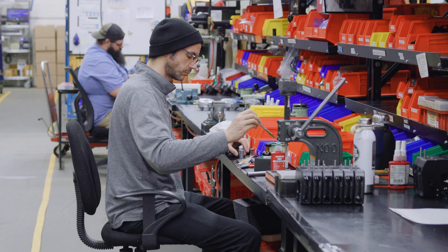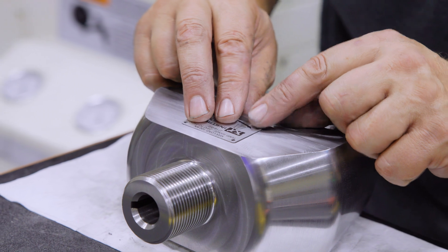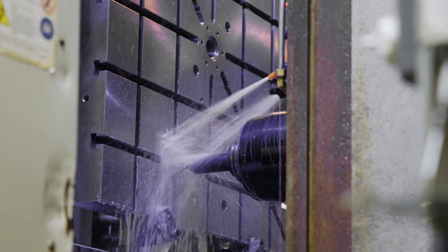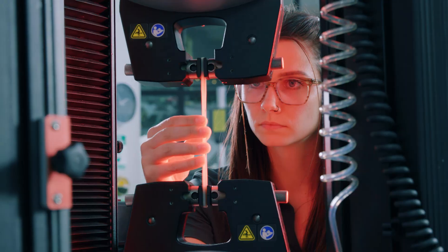At Instron, we pride ourselves on manufacturing mechanical testing equipment to the highest standards, ensuring you have complete confidence in your testing. Our state-of-the-art machine shop in Binghamton, New York is where we manufacture many of the foundational frame components and flagship accessories that materials testing labs around the world depend on.